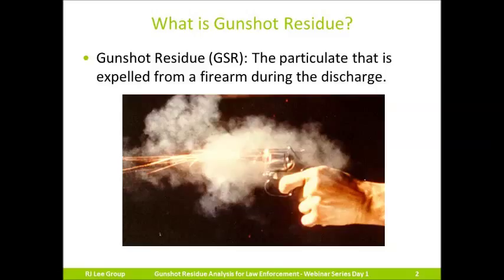Good afternoon. Today I'm going to talk to you a little bit about gunshot residue sample collection. We're going to discuss who you want to sample from, when you want to sample, where you want to sample, and also considerations to take into account when actually performing the sampling.